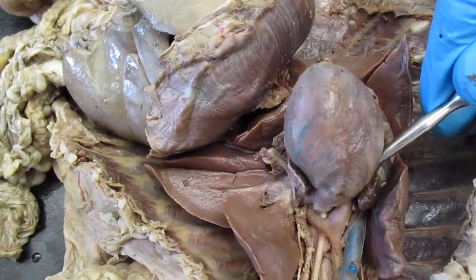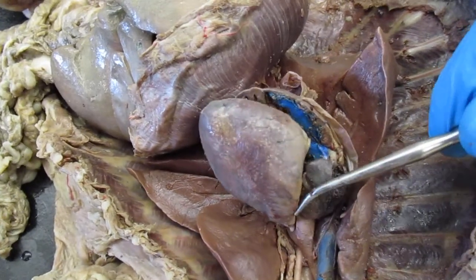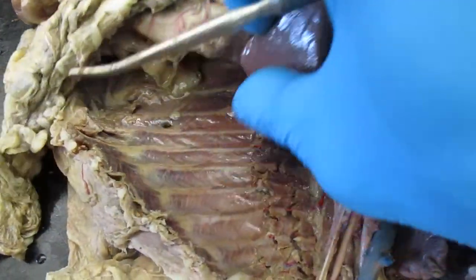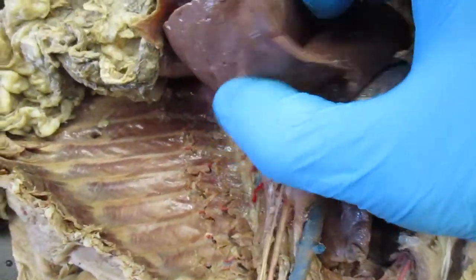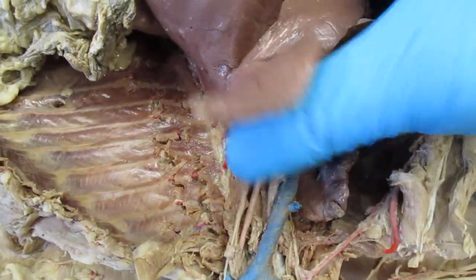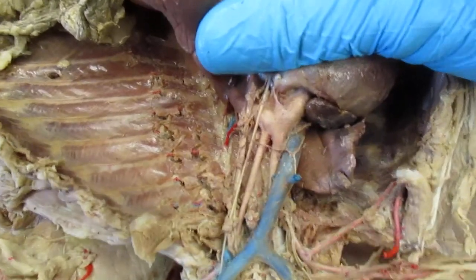Okay, right behind it we have the aorta. This is the ascending aorta right here, and then you have your descending aorta. Remember that this structure here that my thumb is on, well, come on, yeah, there it is.